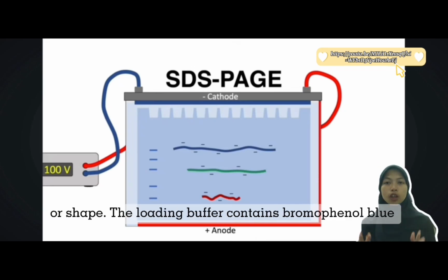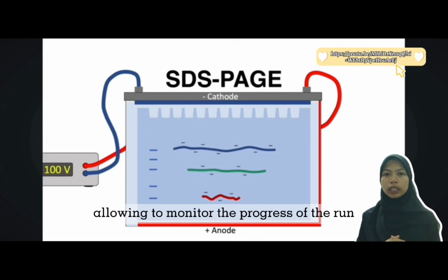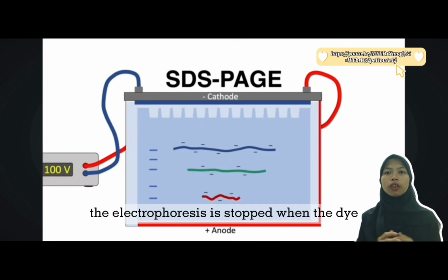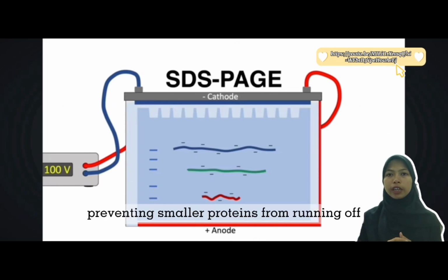on charge or shape. The Laemmli buffer contains bromophenol blue, a small dye molecule that migrates faster than the protein. This serves as a tracking dye, allowing us to monitor the progress of the run. The electrophoresis is stopped when the dye front is near the bottom of the gel, preventing smaller proteins from running off.